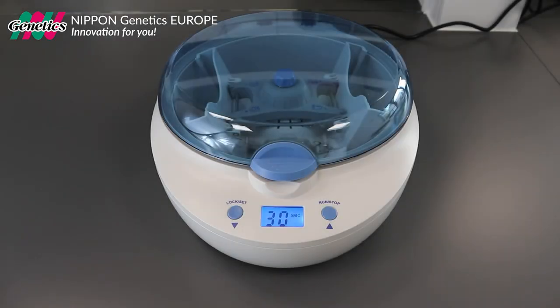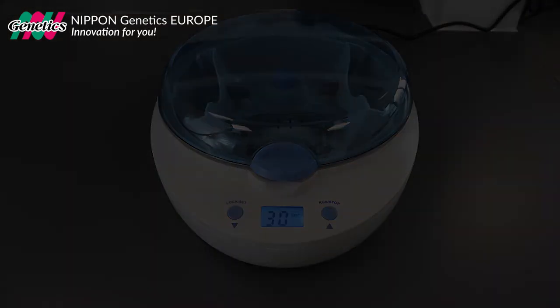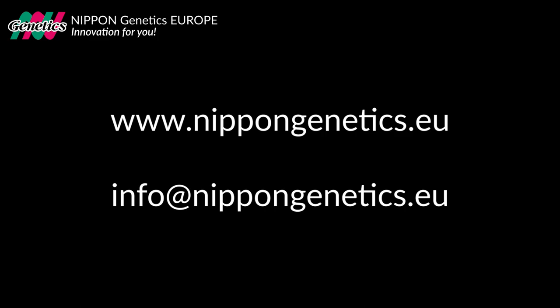The FasGene plate centrifuge was designed to spin down tubes and plates for all high-throughput applications. For more information, visit our website at www.nippongenetics.eu or contact us via info at nippongenetics.eu.